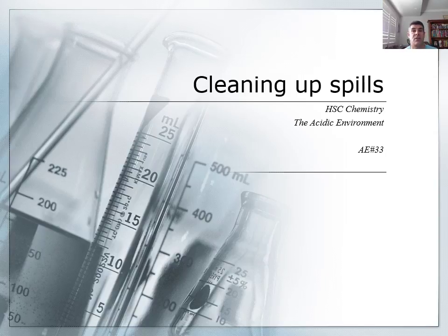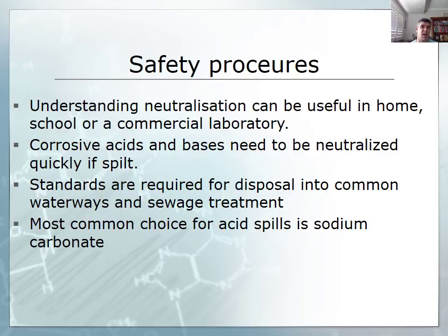In the last little section that we're going to do in section 4 of the acidic environment is just the cleaning up of spills. So this is an aspect of the application of our understanding of neutralization reactions to what sort of things can happen in the science laboratory. So first of all, we need to observe certain safety procedures.